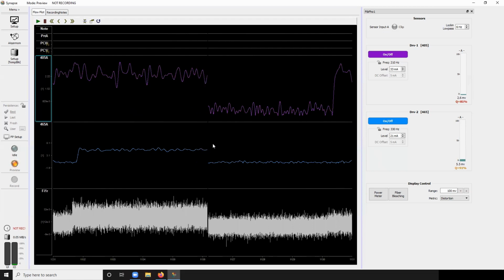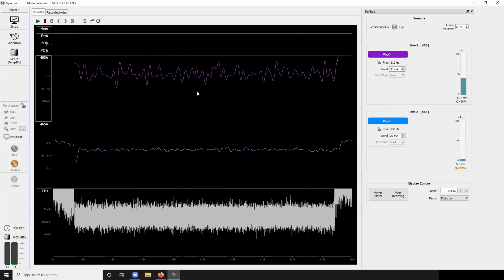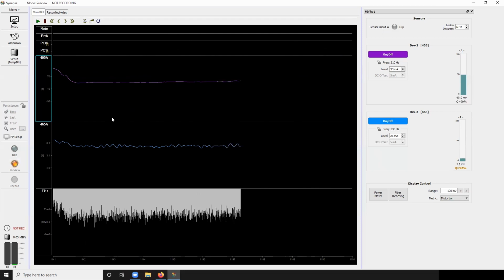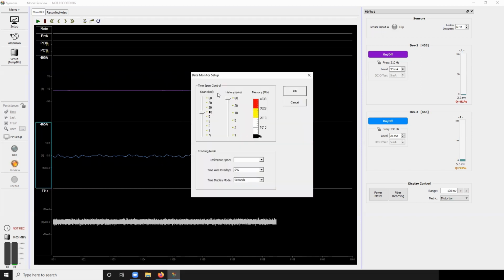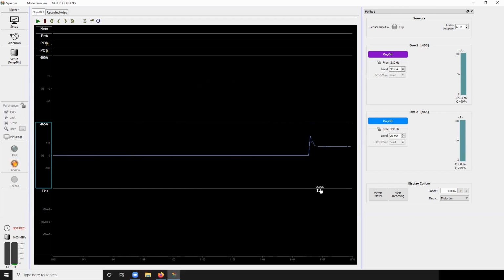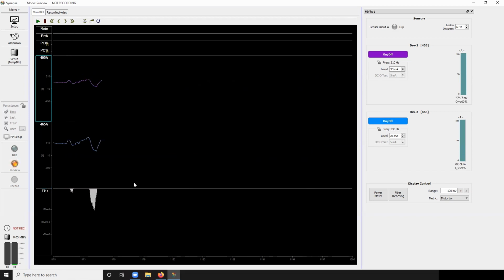Okay, and now what we're going to do is move over to the white surface, and you'll see the 405 increase primarily. So I'll hold shift and drag, and then go back to black. Okay, you get a tiny bump in the 465, but once we go over the yellow highlighter, the 465 jumps up dramatically. So go over the yellow surface now. Yeah, and it goes way, way, way up. So the relative magnitude of change here is much more on the 465. Go back to black.